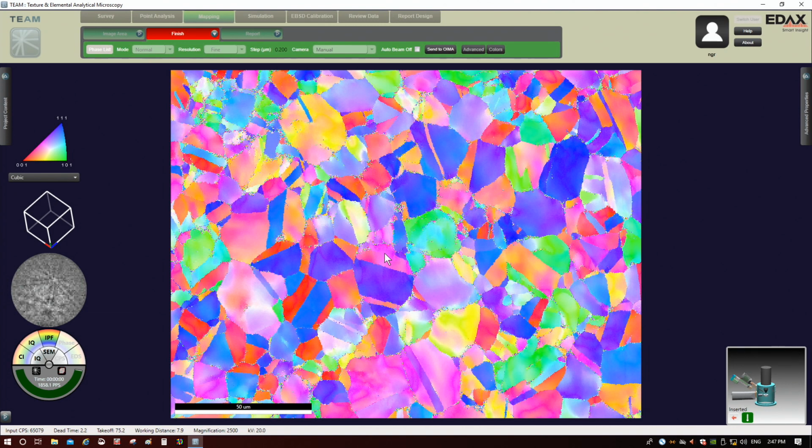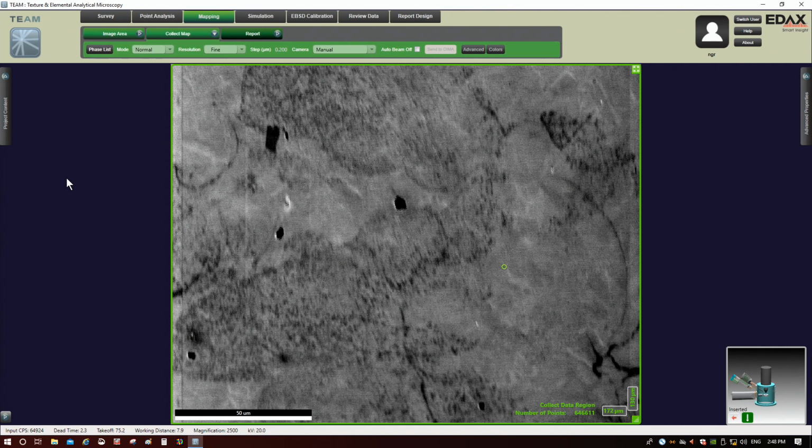So that is a basic tutorial about how to do EBSD here. Again, this doesn't talk about the ins and outs of data processing. That will be its own video at some point later. All right, go ahead and click finish here.